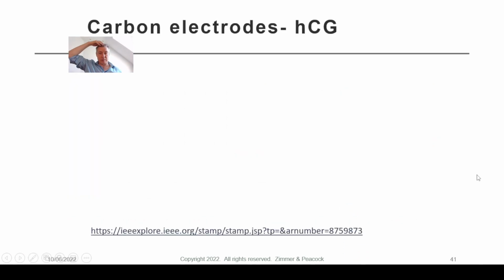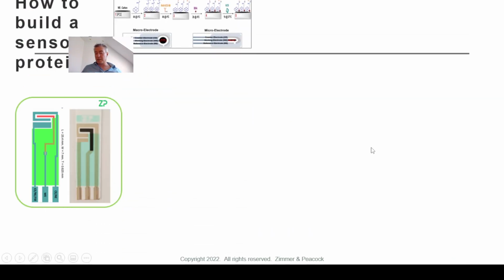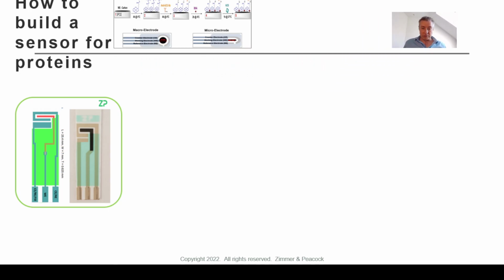Now carbon is my preferred material to go to these days. There's not much limitation on the amount of carbon that we can get in this world. There's quite a nice paper that we were authors on. It's probably worth a look because it's quite a simple fabrication procedure. As I say, there's a molecule in this paper called pyrene NHS. It seems to be in short supply at the moment, so you might have to get it off the ZP web store, but hopefully it'll become more available. Its lack of availability at the moment is linked to many things. At the time of doing this video, supply chains are very messed up in the world, and so even chemicals are becoming a little bit hard to get hold of.